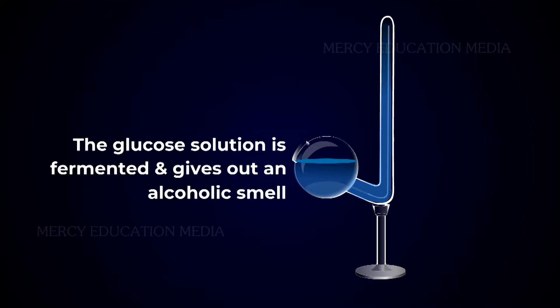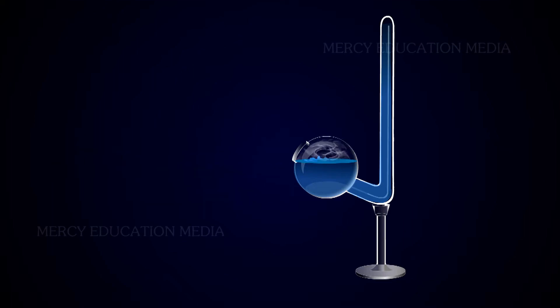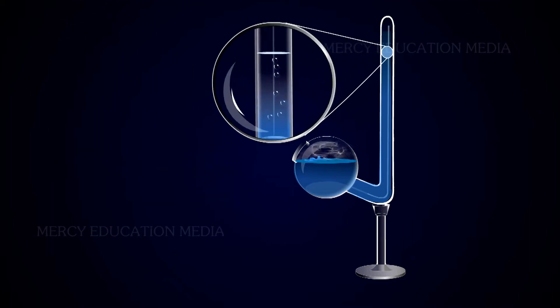After some time, the glucose solution is fermented and gives out an alcoholic smell. The level in the upright tube will fall due to the accumulation of carbon dioxide gas.